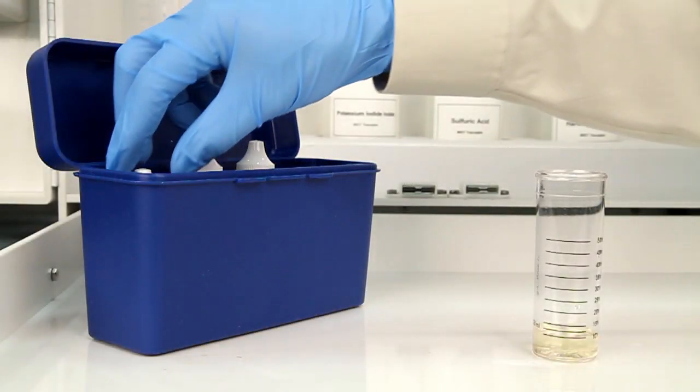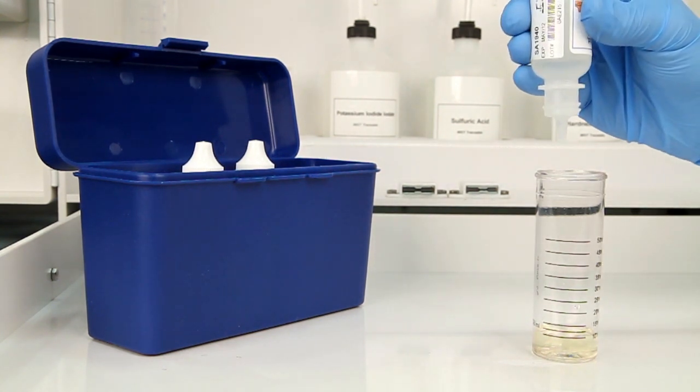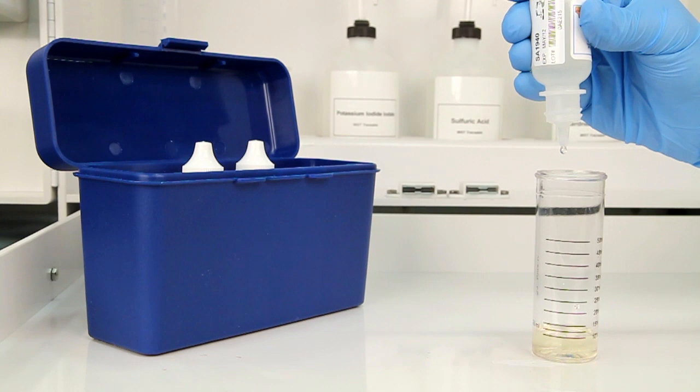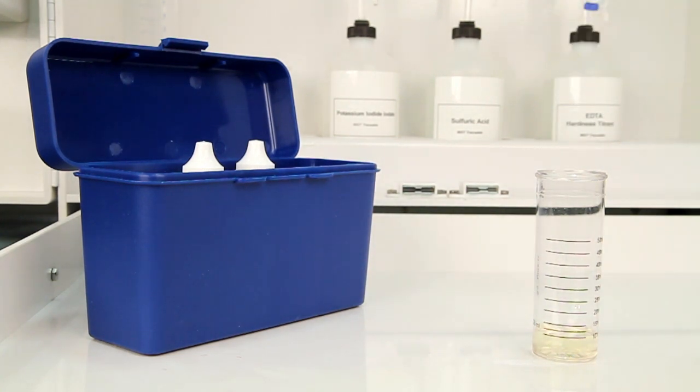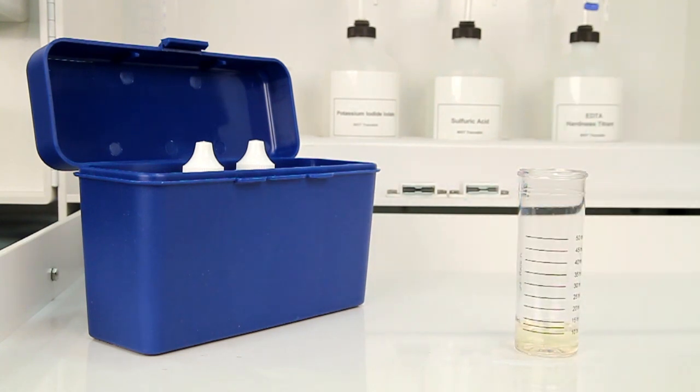Once you have collected an accurate sample, the next step is to add three drops of sulfuric acid 50%. The bottle contains a dropper tip, so it's important to hold the bottle vertically to get a consistent drop size. After the addition of each reagent, swirl the vial to make sure the sample is properly mixed.